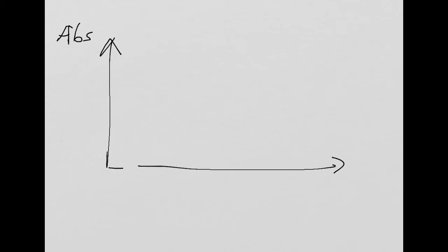So, absorbance, and they have something like that in there. 0, 10, 100, 200, 800, something along those lines.